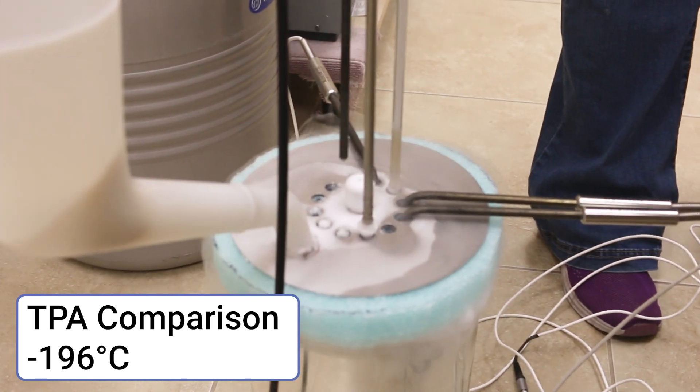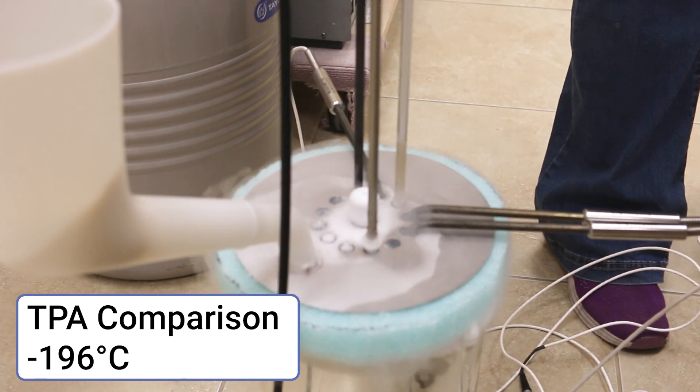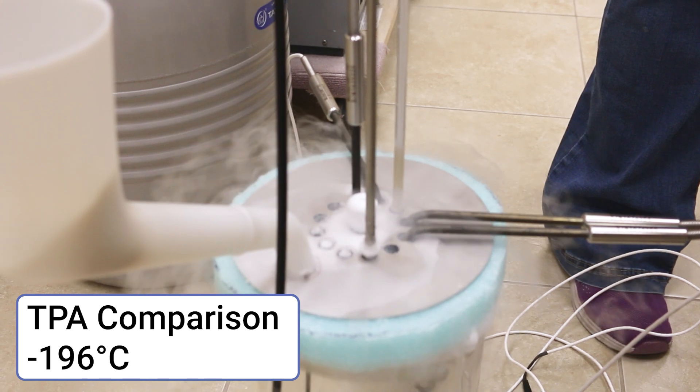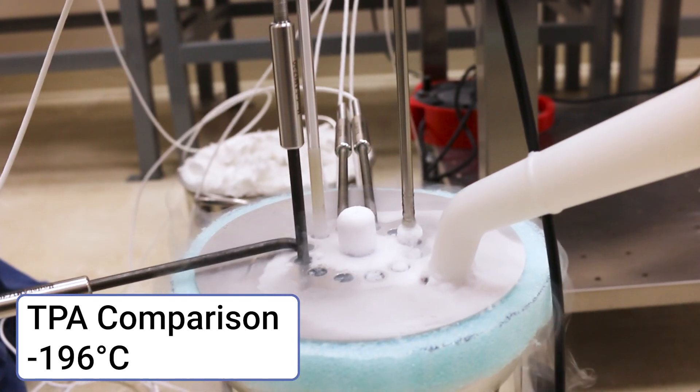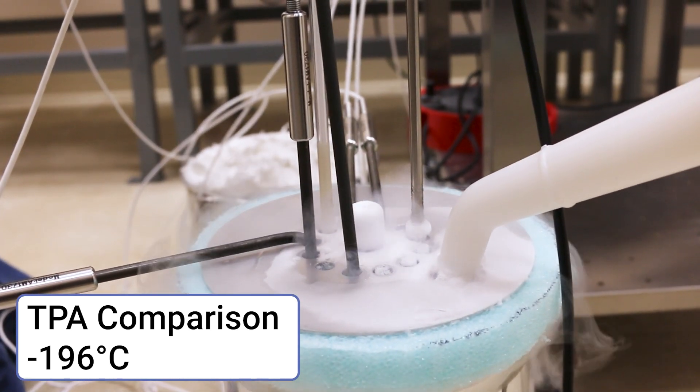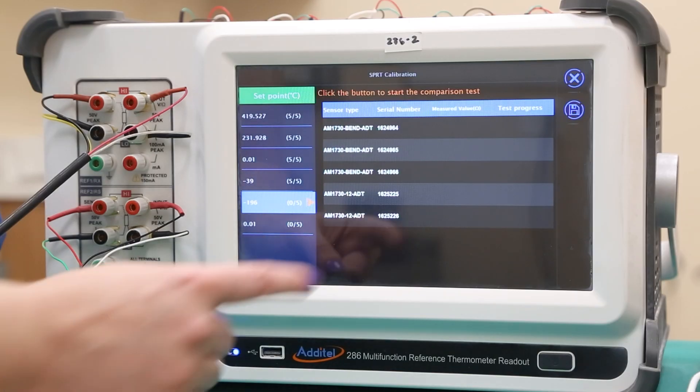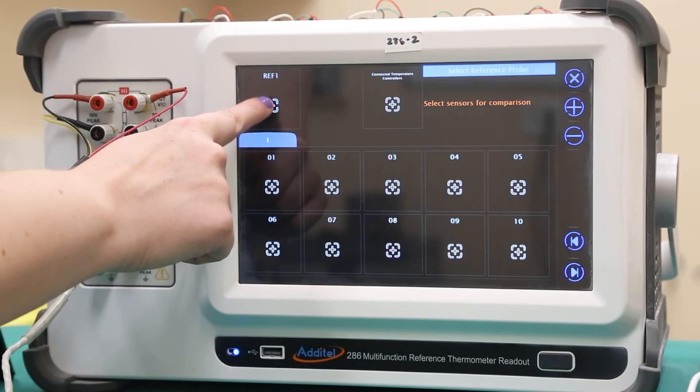The next calibration point, the triple point of argon, will also be done using a comparison test by using a liquid nitrogen comparison calibrator at the temperature of roughly negative 196 degrees Celsius. Once the DUT probes and a reference probe have all been inserted into the liquid nitrogen, the same procedure as the previous comparison test should be followed.